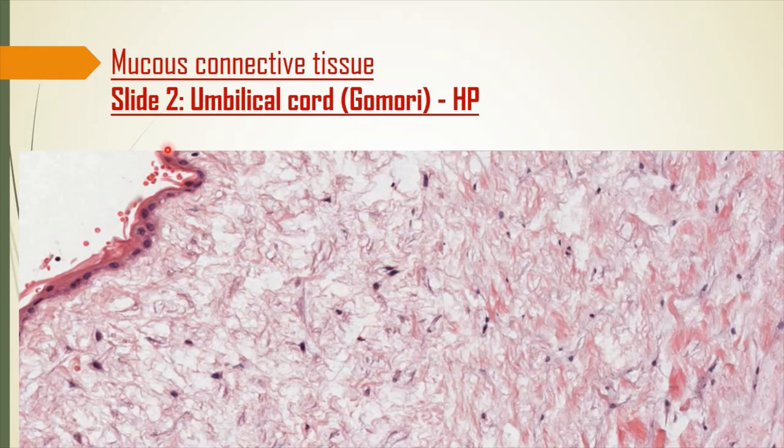Now, this amniotic membrane epithelia, what type of epithelia is it? It looks like simple cuboidal epithelia. So look at it, identify what type of epithelia it is, and label it as well at high power. So for this slide, draw at high power and at low power.